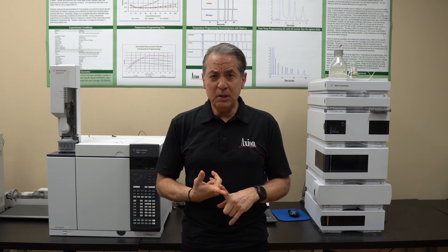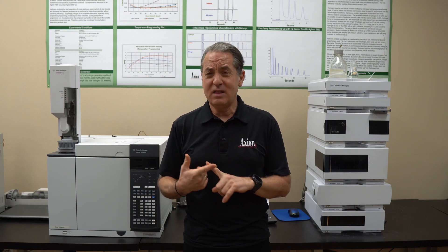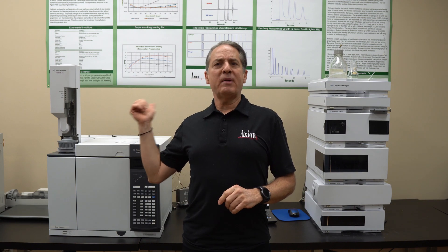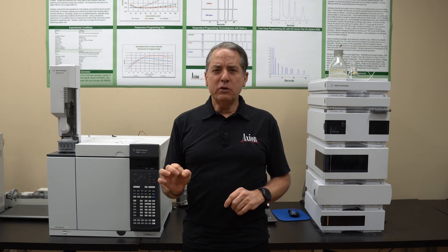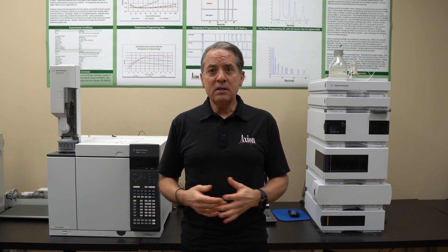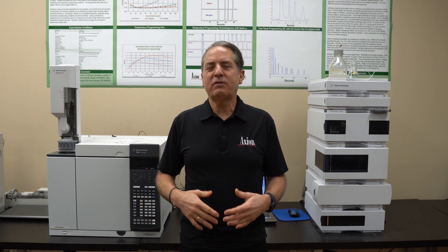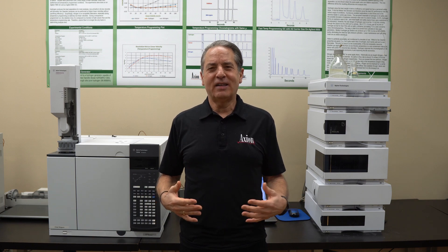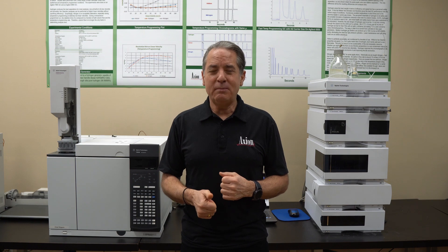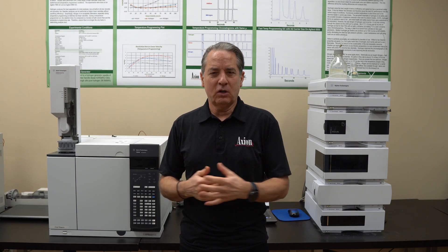Make sure you're using good quality tubing. I would buy the tubing — anything you're going to use for plumbing — buy it from a GC company. Don't buy it from the hardware store. I did all the plumbing myself here at Axiom. I use quarter inch copper for all the helium lines and for all of the air lines, and then I use eighth inch stainless steel for hydrogen. I'm old school with hydrogen just from a safety perspective. Buy it from a GC company because you don't want cutting oils inside that tubing because that will eventually cause impurities.